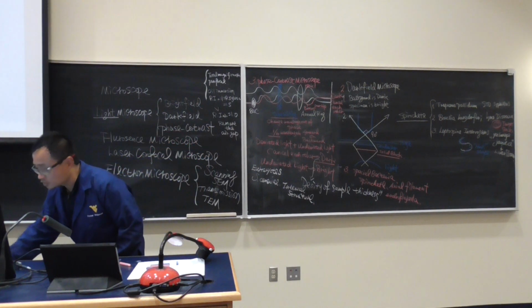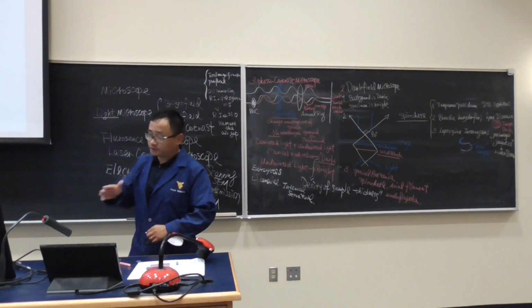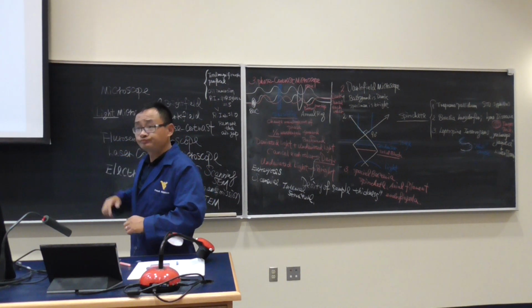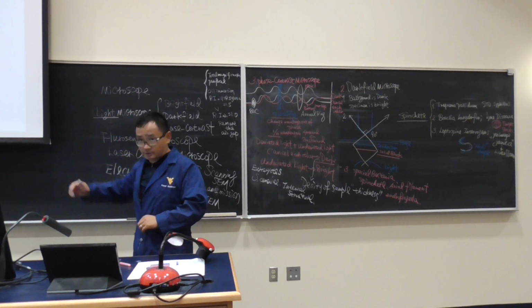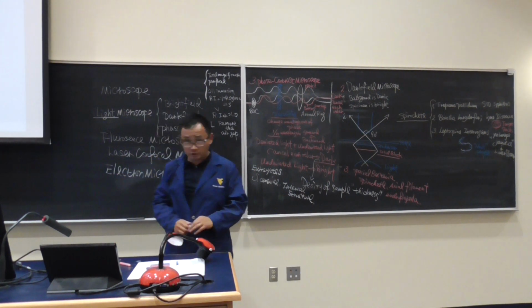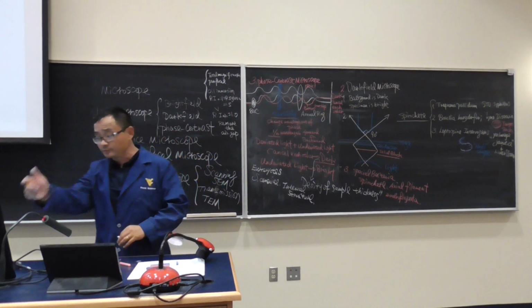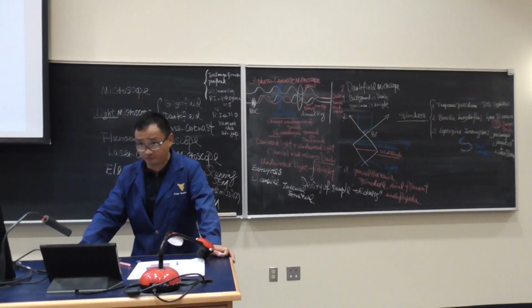And this slide shows very clearly, you can see. Light microscope, bright field, you can see a little bit. The far right side is a dark field microscope. You can see a big shining there, is that right? How about the middle one? Phase contrast microscope. Compared to these different microscopes, do you like the middle one better? Yes, because you see the internal structures very well.